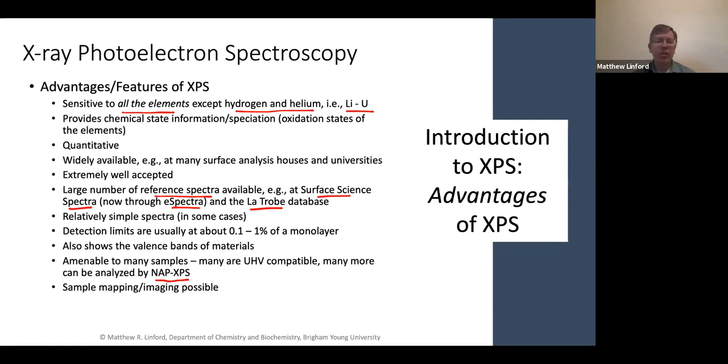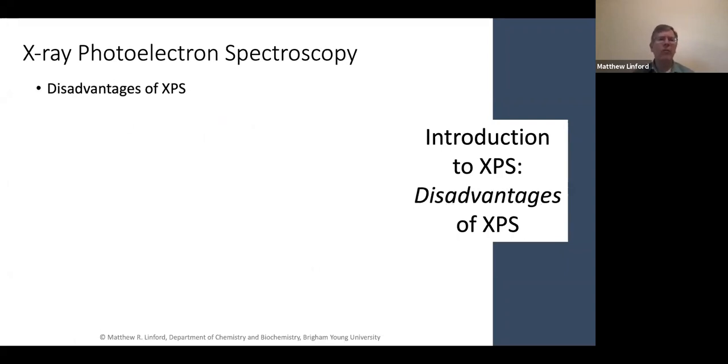You can do sample imaging and mapping. It's not terribly fast, but certainly you can make maps of your surface, and both conducting and insulating samples can be analyzed. How you analyze an insulating sample and the way you have to do the charge compensation, that would be a topic for a more complete course on this topic.